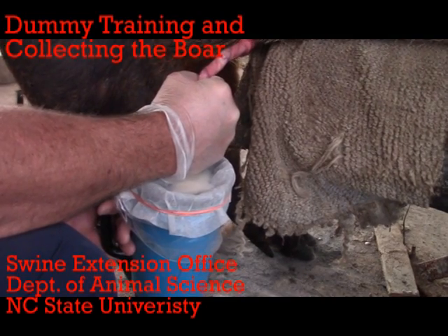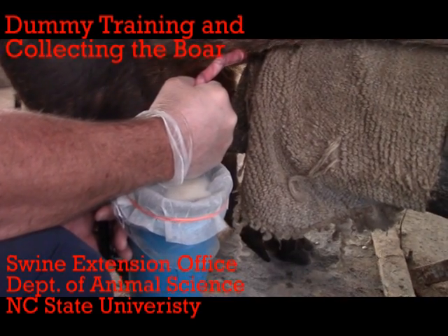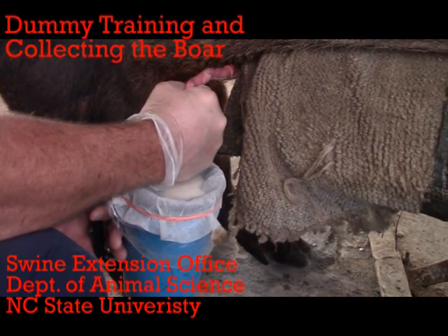The purpose of this video is to detail how to dummy train and collect semen from a breeding boar. Information on how to construct a semen collection pen and how to extend and store semen is presented in other videos, and links to these videos are provided in the video description below.